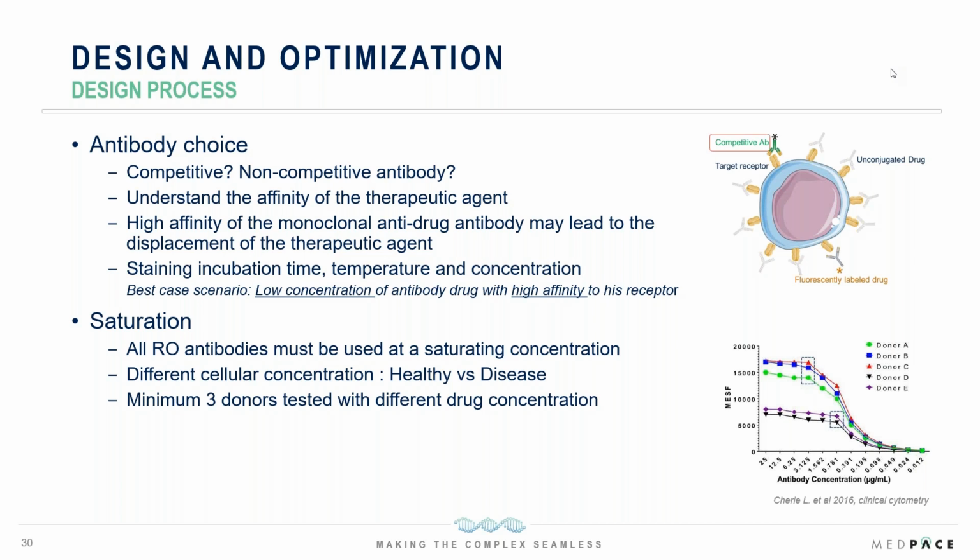So this is really something important as well, the saturation of your antibody. Okay, we can go to the next slide.